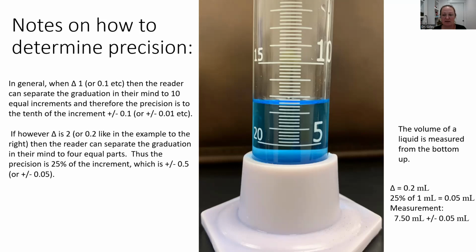So we would still read the measurement to the nearest hundredths, right? But again, you wouldn't write something like 7.49, for example. You might write 7.45, 7.50, or 7.55, right? So that's sort of what your brain can measure between these two hash marks.